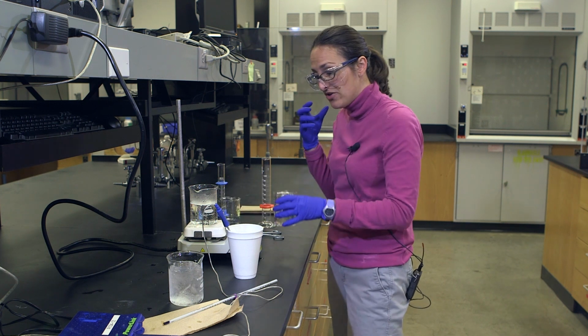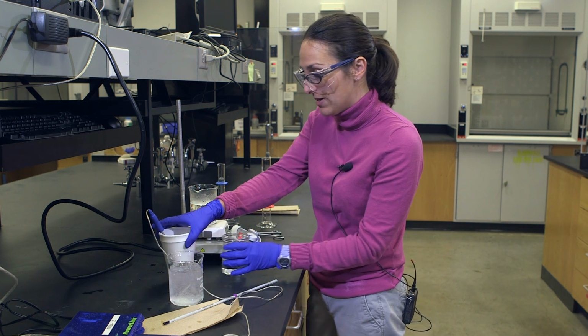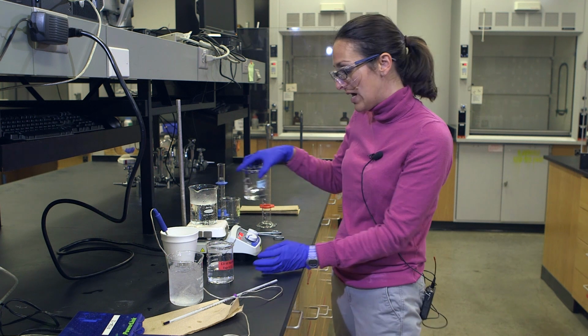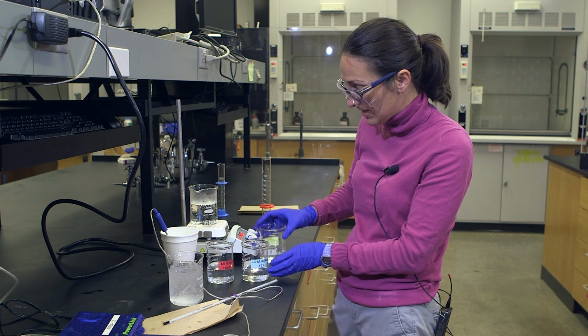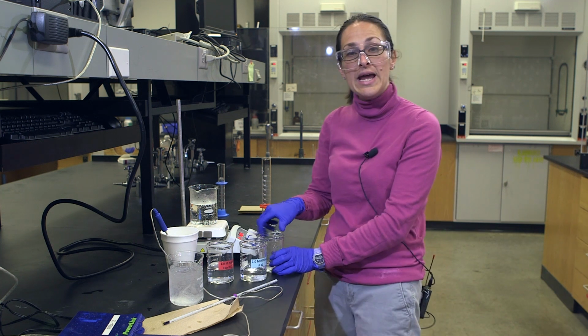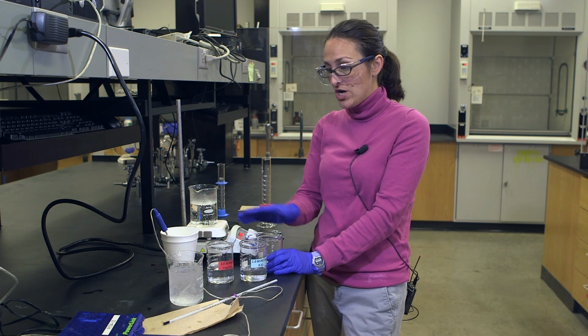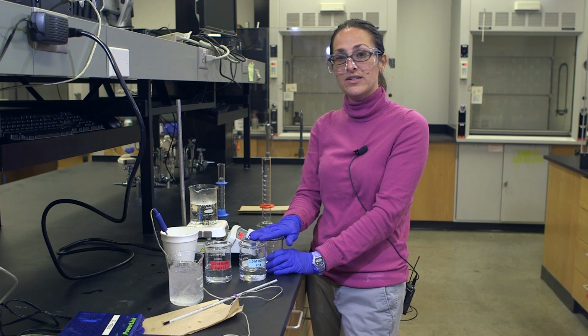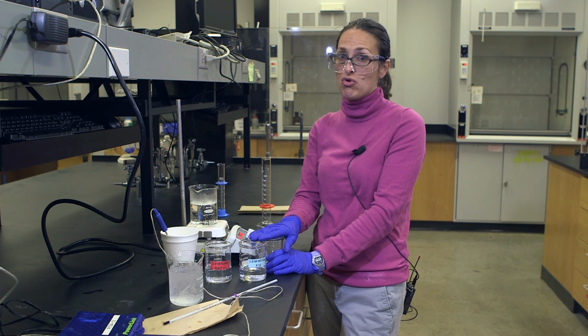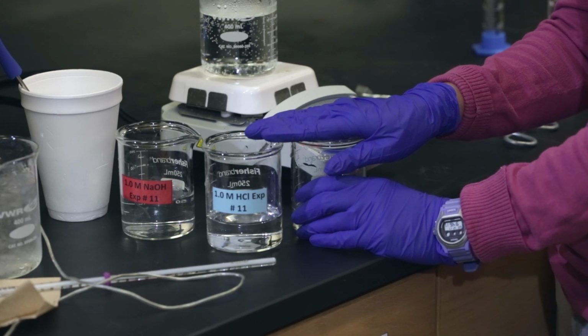All right, so another word of caution about experiment 11. We are going to be using pretty concentrated solutions of sodium hydroxide, hydrochloric acid, and sulfuric acid. And you know that this is a hydroxide, that's a strong base. Hydrochloric and sulfuric acid are both strong acids, so we need to be really careful here.